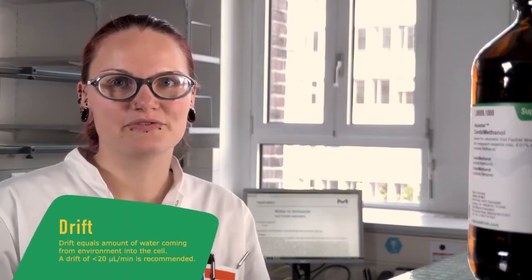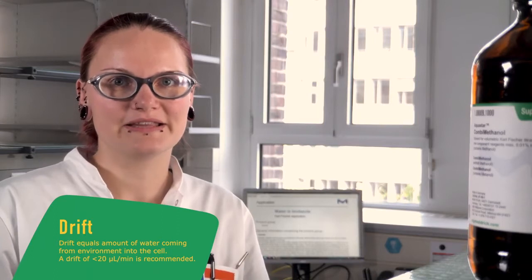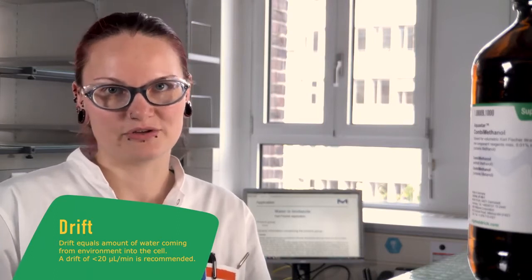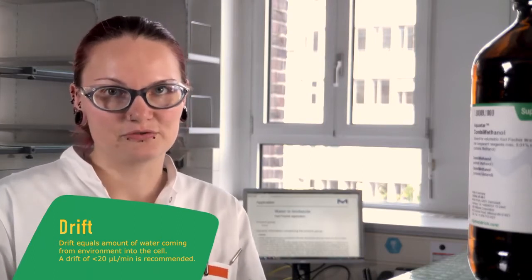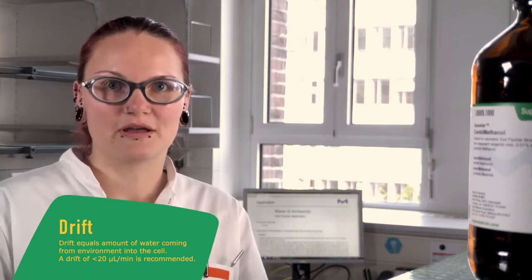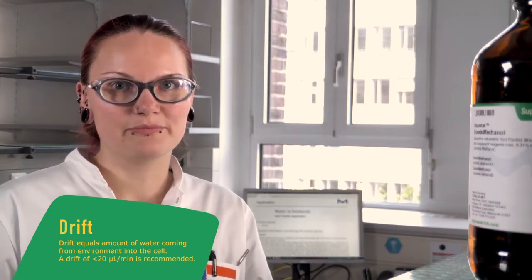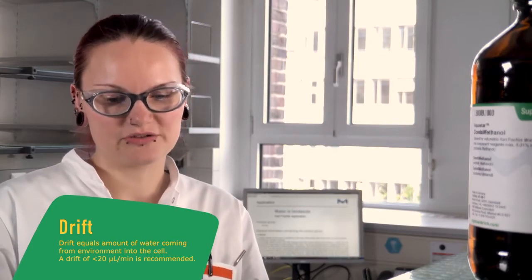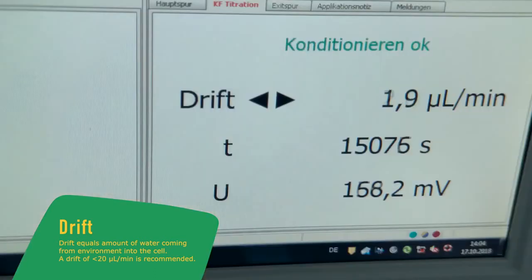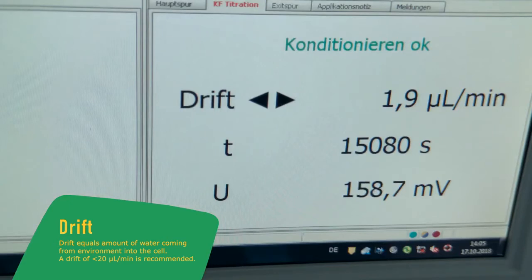The titration cell is never really tight, that's why we have a drift. The drift shows us the amount of water which comes from the environment into our titration cell. The drift should be below 20 µL per minute and stable.